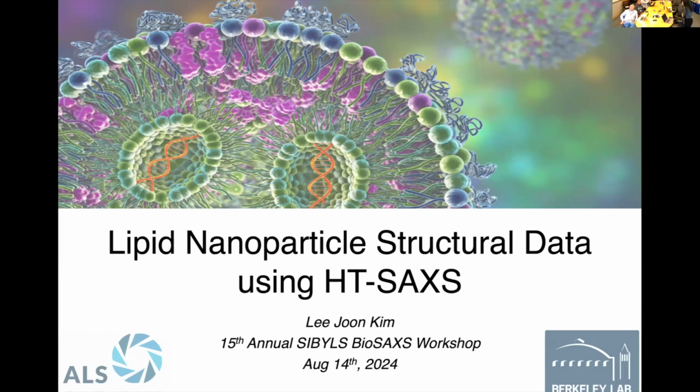And as Greg mentioned, this talk is about lipid nanoparticles. And specifically, I'm going to talk about how we've been using our HT-SAXS platform to characterize lipid nanoparticles for vaccine development and design.